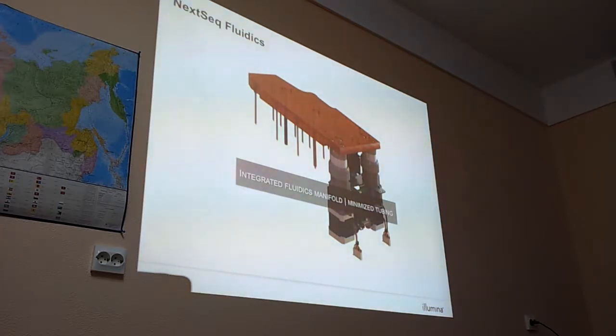And we had a not very good experience with one system, the HiScan SQ. In Russia you don't have this system, and this is good. In other countries, for example in Poland, they have several, and they are not so happy in general. Some work without problem, but many give problems because they have extremely long tubing, and from this we learned that you have to minimize the tubing. And this is what we did.